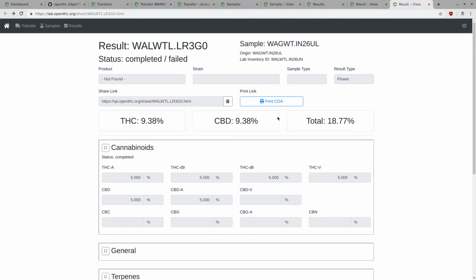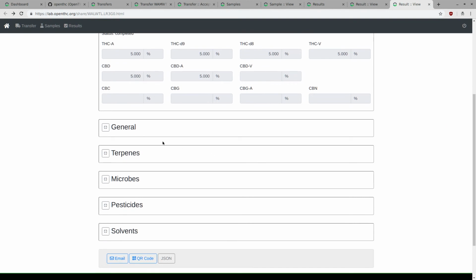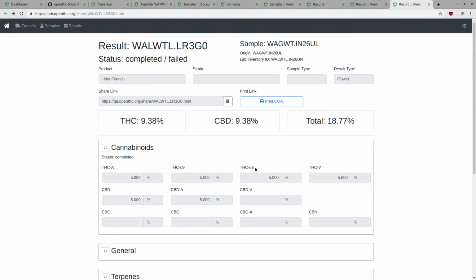And then at the end of it, we have a reasonably okay looking web page to present this information to the consumer. It's slightly different from the page that you were looking at. All the fields are read-only on here. We do have all of those little bits on here. I'm authenticated when I'm looking at this page, so I do see some of the buttons at the bottom that you otherwise wouldn't see. And then if a COA had been uploaded into Leaf, or if a COA had been uploaded into this system and not into Leaf, that would be available from the print COA button, which of course doesn't work for this one, which is missing a bunch of other stuff, and we've never uploaded the COA.